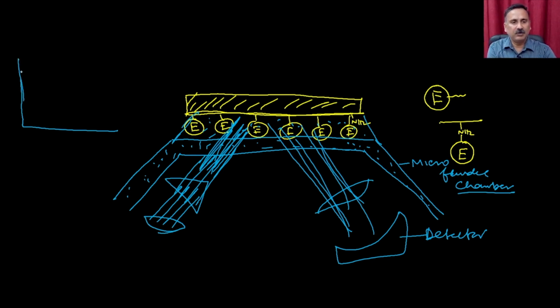What I am going to see is the intensity versus angle. So I can see no change in the intensity because all the light is going to be captured. If I'm sending the light with lambda, it is also being collected by the detector because it is going to show me the total internal reflection. Because of that, all the light is going to be collected.